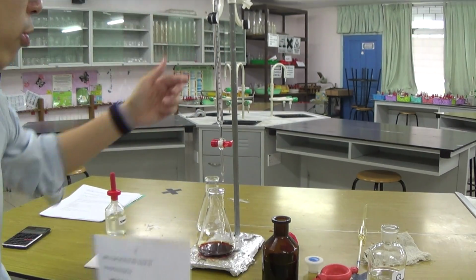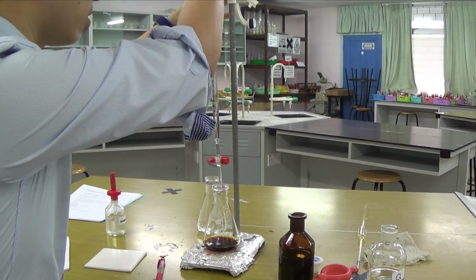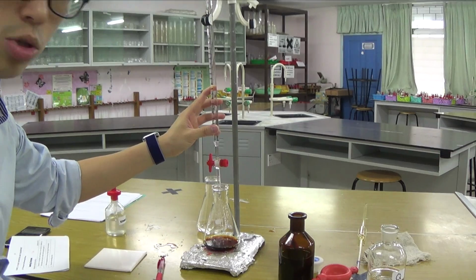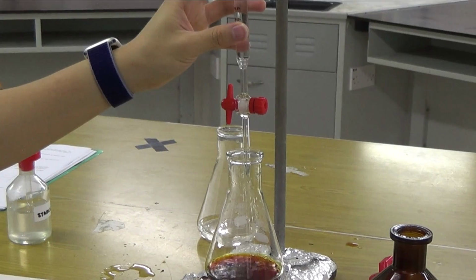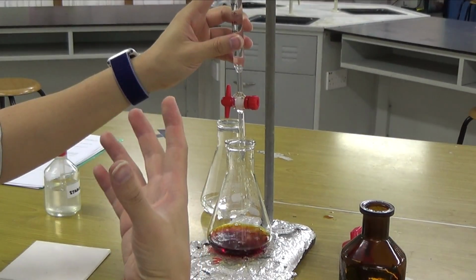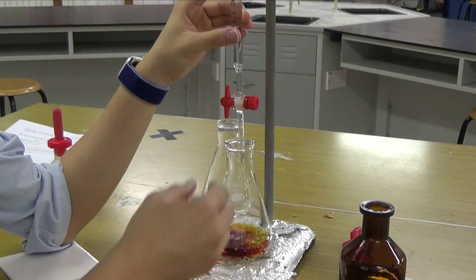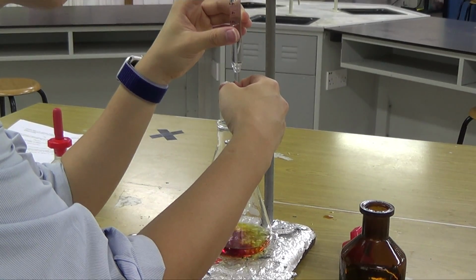So I need to be careful when I reach 41 and do it drop by drop from there, just to be safe. And don't forget to add your starch indicator at the end. So where's 41? Yeah, 41 is here. We're just going to zoom in a little bit. I don't need to swirl or anything, because I've done my exact titer. I roughly know where they are now. So 41 is where I will stop, because that is just before the exact endpoint. Getting very, very close.